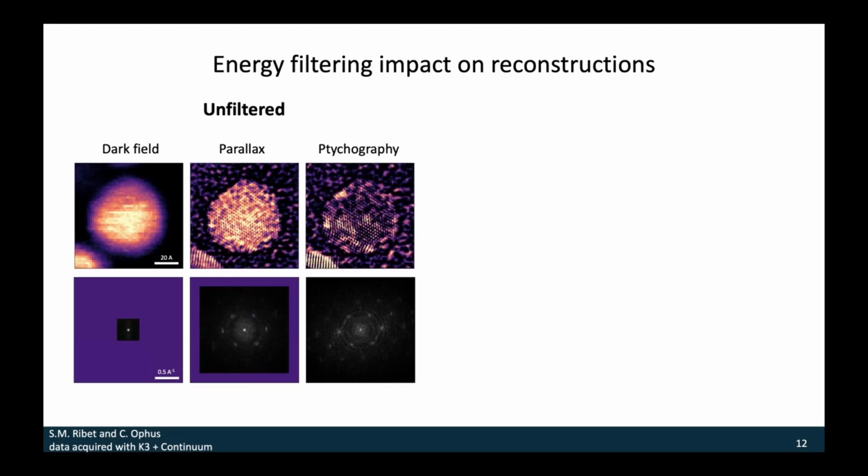But one of the things that I don't like so much about this particular example is that you're not converging your low spatial frequencies. And this makes sense given the unwanted background signal and the types of spatial frequencies where we'd expect that to be.